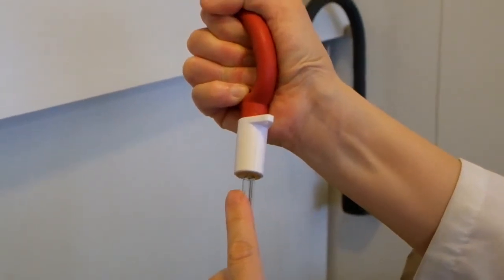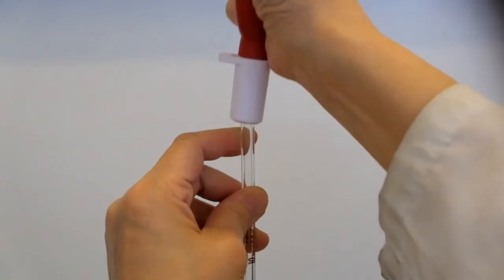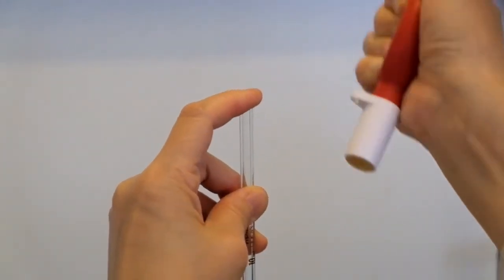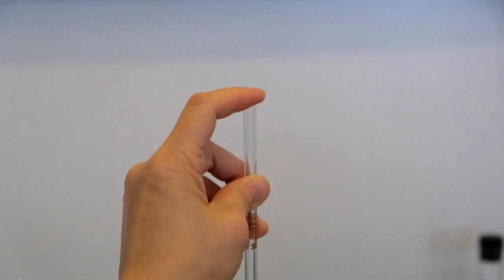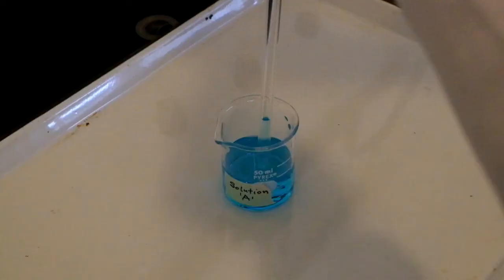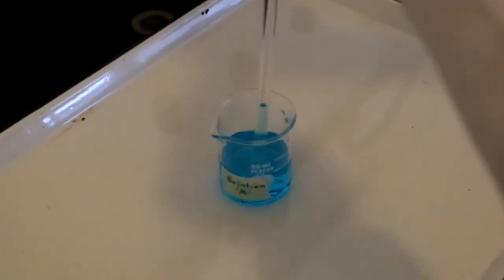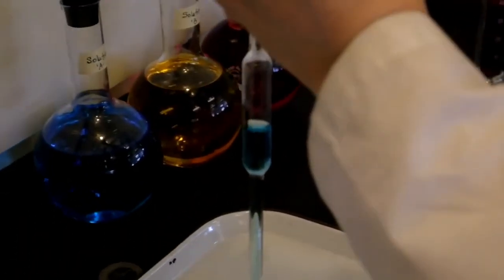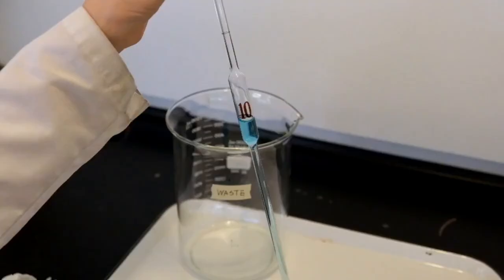If you're right-handed, depress the pipette bulb in the palm of your right hand. Hold the pipette in your left hand, but keep your index finger near the top of the pipette. This will make it easier to put your left index finger over the top of the pipette and hold the level of the solution when you remove the pipette bulb. Keep the tip of the pipette below the surface of the liquid to avoid sucking up air and sucking the solution into the pipette bulb. The level of the solution should always rise up the pipette. The solution should not drain back into the beaker.